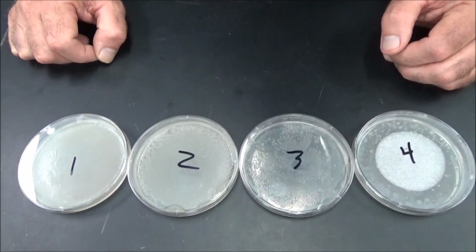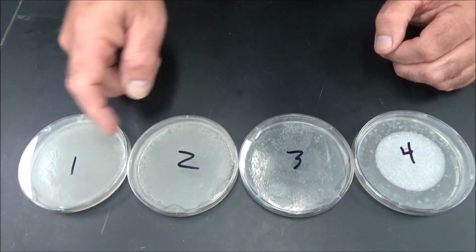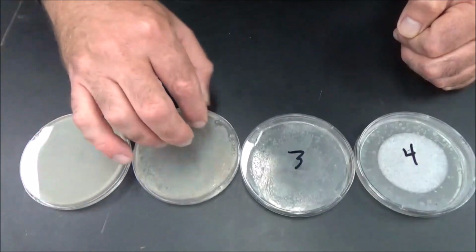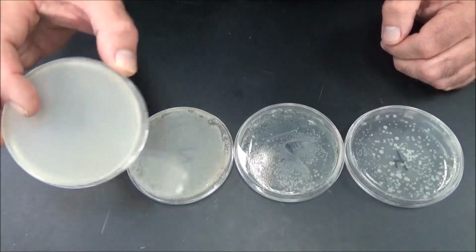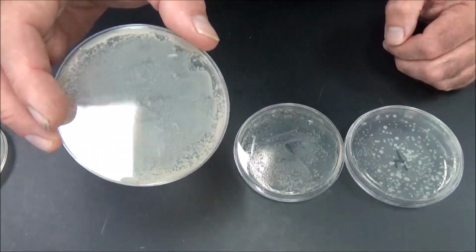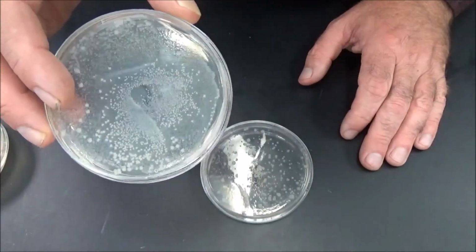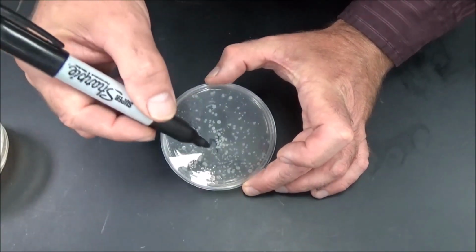Okay, so here are the 4 petri plates, 1, 2, 3, 4. Remember which one is most concentrated? That was the first one. The least concentrated, most dilute, was number 4. Now, when we flip these over, we can get a better view of how many bacteria are growing. Plate number 1 is totally overgrown, so that's unusable. Plate number 2, I mean, there's thousands of colonies. We can't count them. Plate number 3, we might be able to count them, but plate number 4 is the most dilute, and look, we can probably get a count.